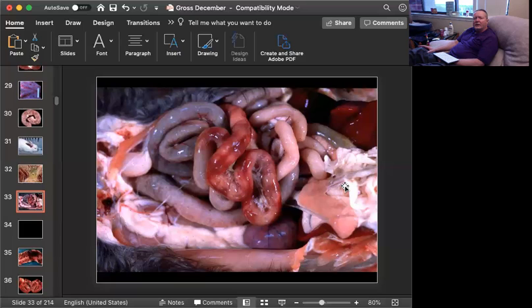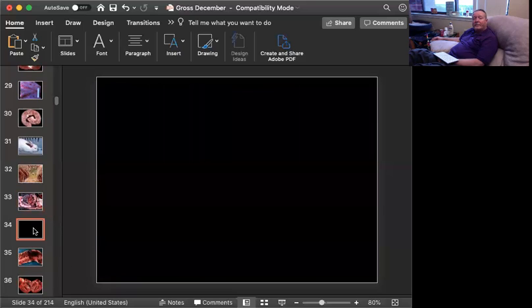You will see necrosis within lymphoid organs. Lymph nodes may be small. You'll see white pulp necrosis in the spleen, necrosis in the thymic remnants. So those are the hematopoietic organs that you want to think about as concurrent lesions associated with feline parvovirus infection. Well, that brings us to the end of Gross Path Challenge number 55.